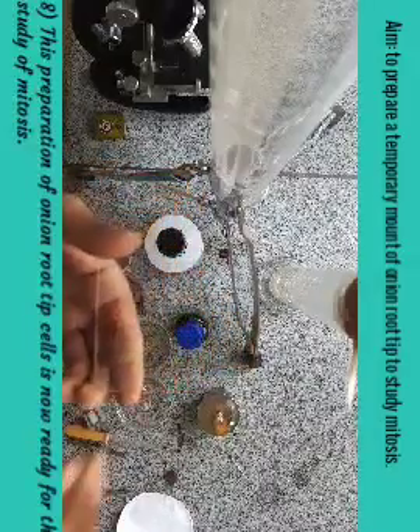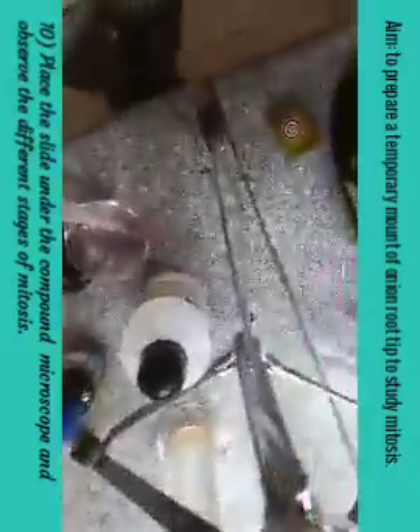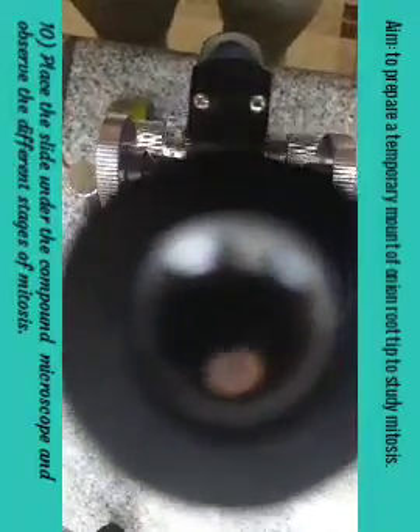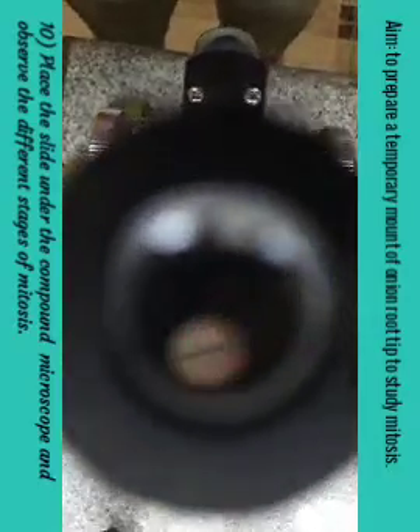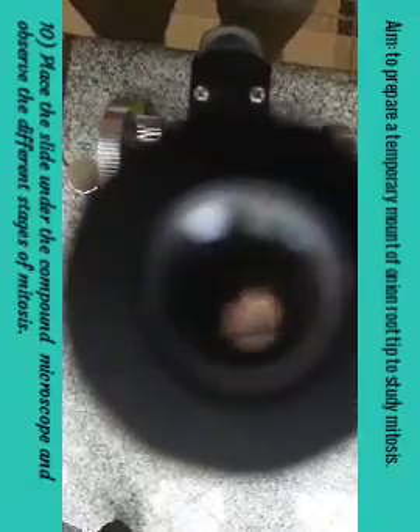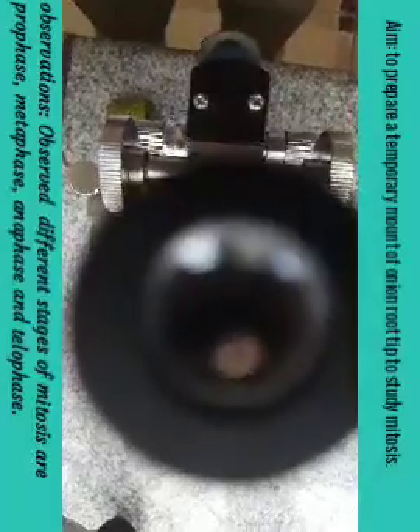Now put this slide under the microscope and observe through the eyepiece. When you observe, you will find this kind of structure in the slide. These are chromosomes — you can see them; they are minute. So, under the microscope we have observed the chromosomes at different stages like prophase, metaphase, anaphase, and telophase.